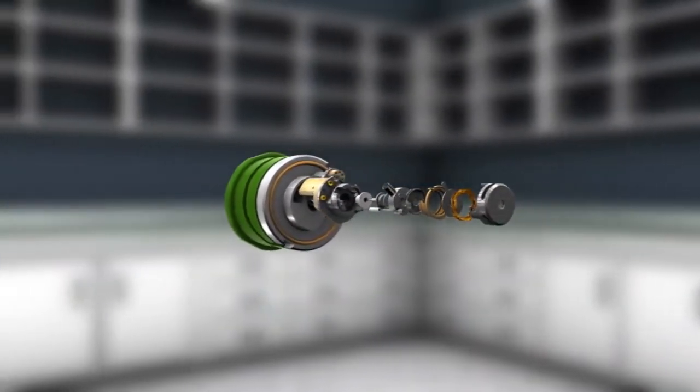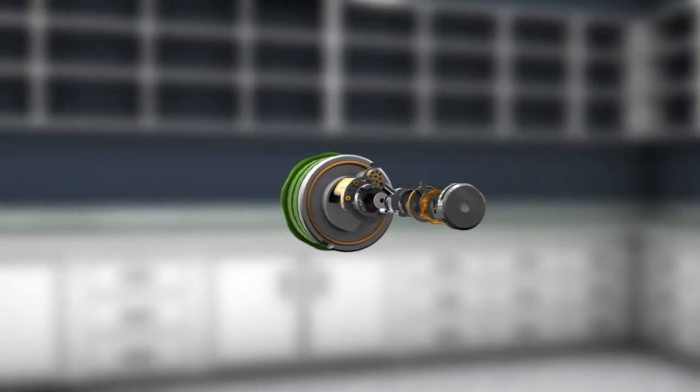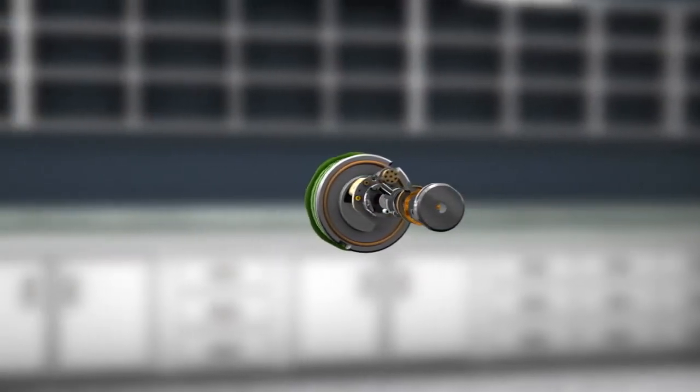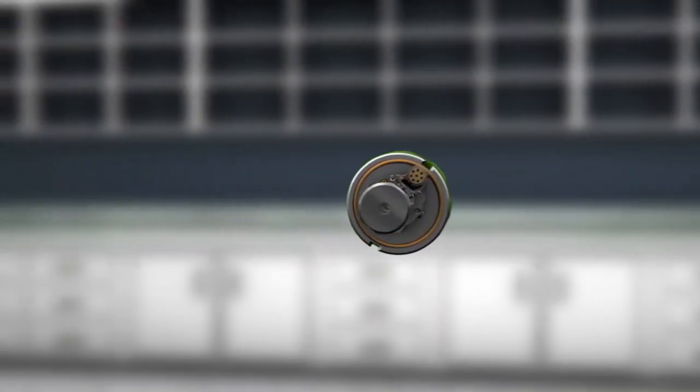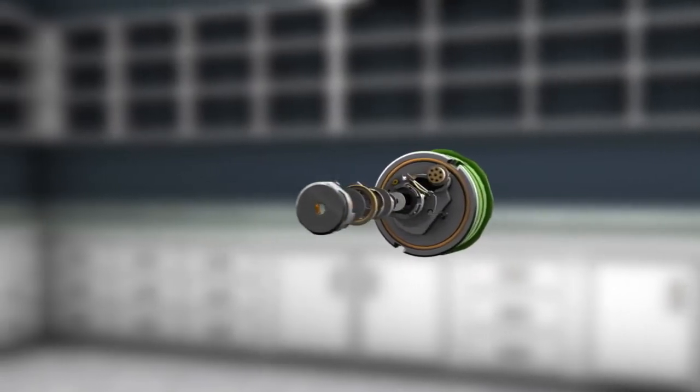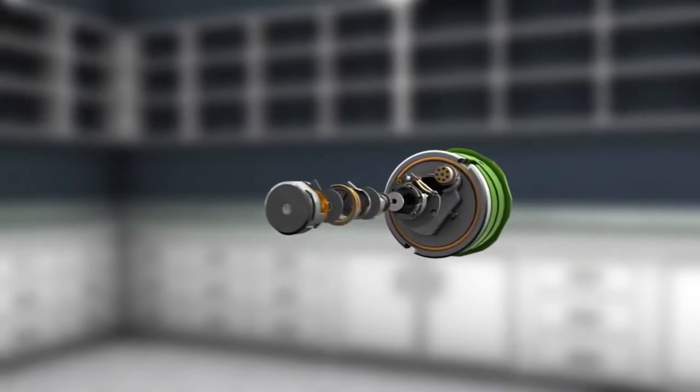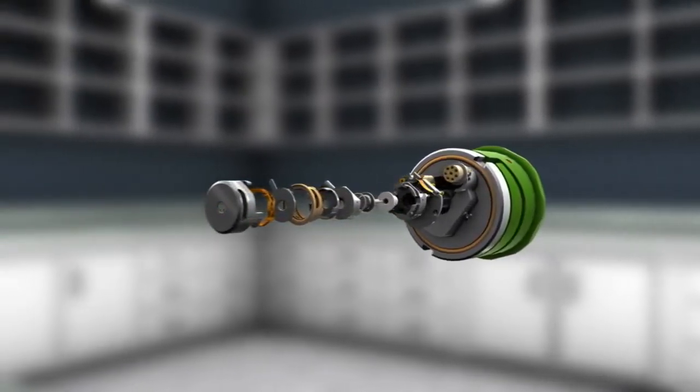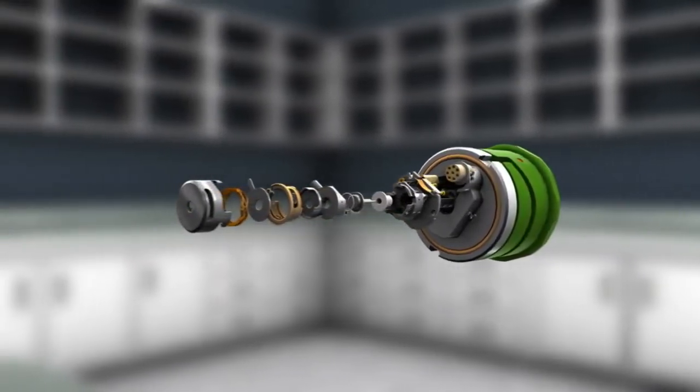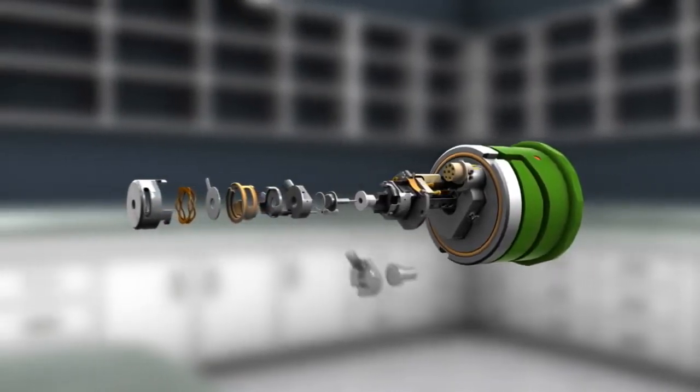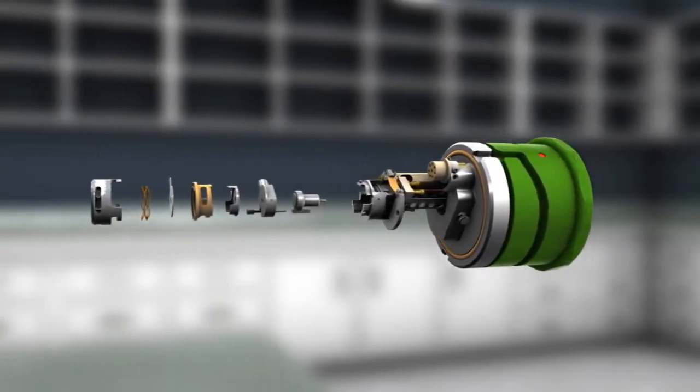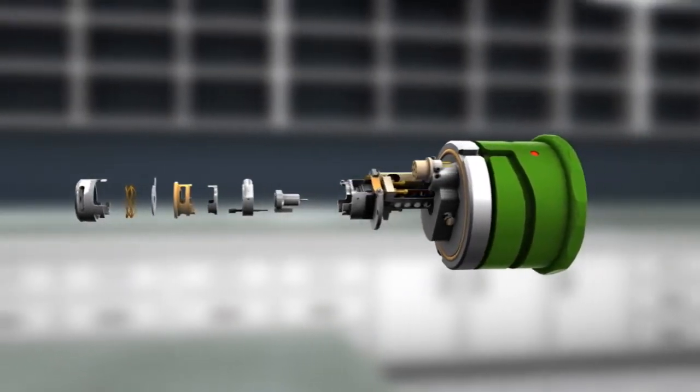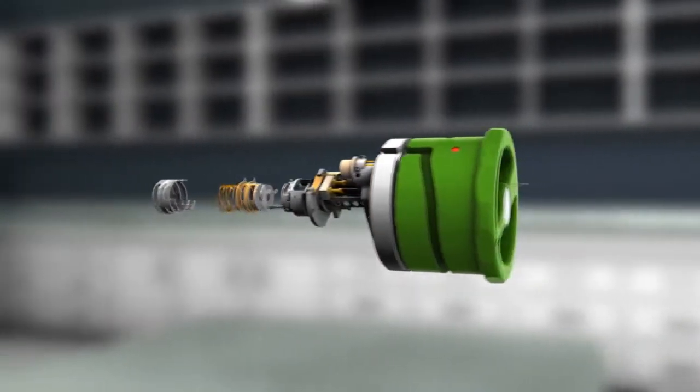Engineered with very few parts, the smart source can be disassembled, cleaned, and reassembled in a matter of minutes. It even offers both EI and CI ionization capabilities in the same housing to suit a broad array of sample types, and can be easily switched between the two by simply swapping out a few components.